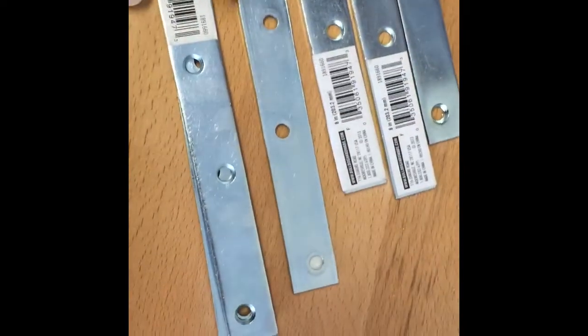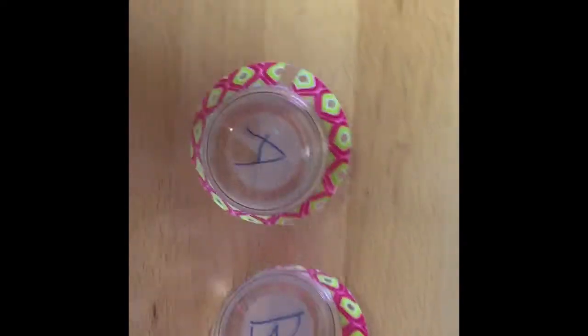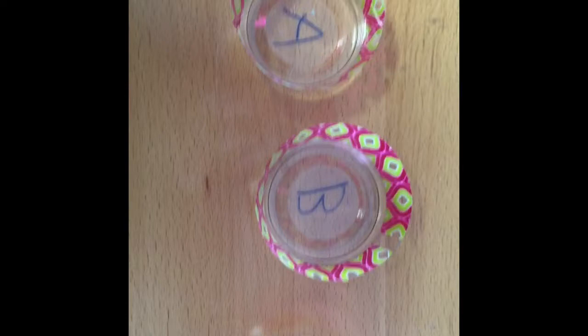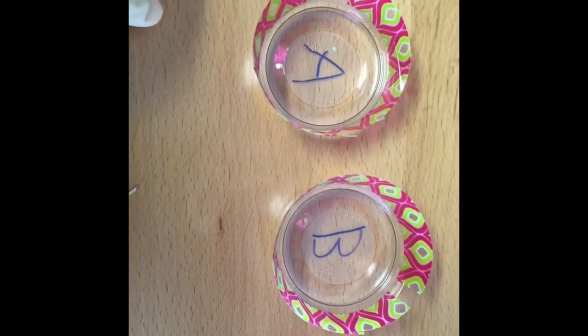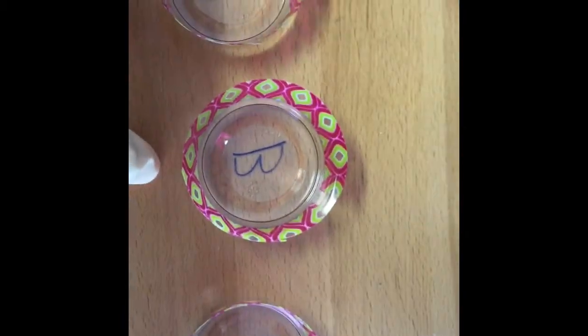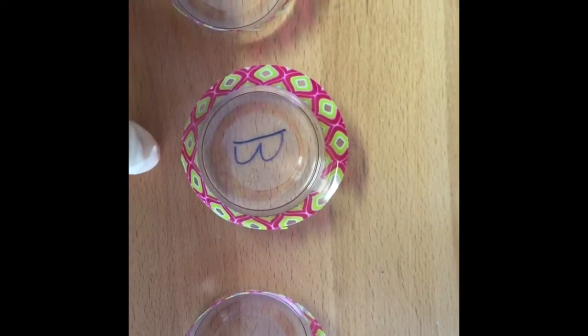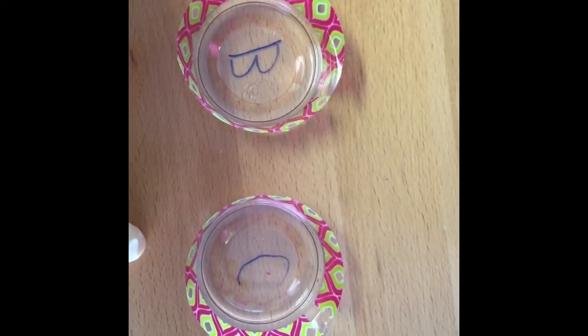We've also got some 8-inch metal plates, metal frame hinges almost, that I'm going to weld together using the epoxy resin. You notice we have A, B, and C columns in our containers. Container A is going to contain 3 parts epoxy, 3 parts resin. It's going to contain equal parts. Container B is going to contain 1 part epoxy, 3 parts resin. And container C will contain 3 parts epoxy, 1 part resin. Right?